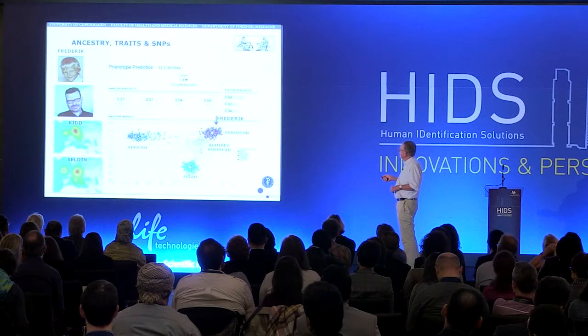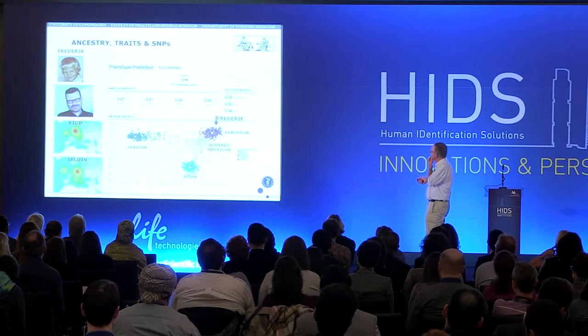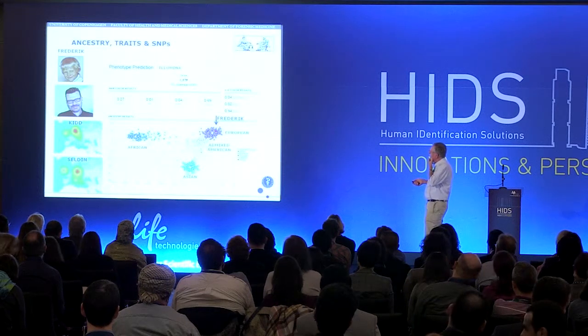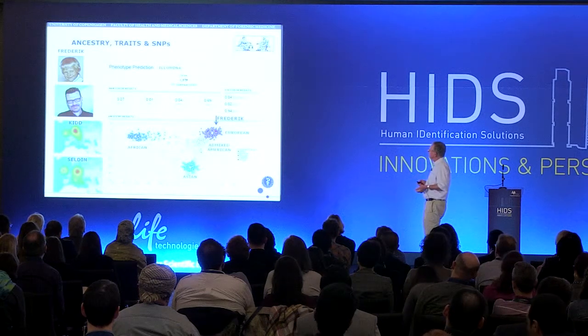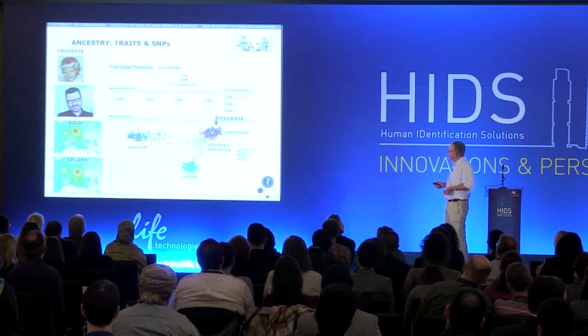And eye color, 94% blue, and most likely you can see that he has blue eyes. And here you see an analysis of the ancestry, European ancestry.